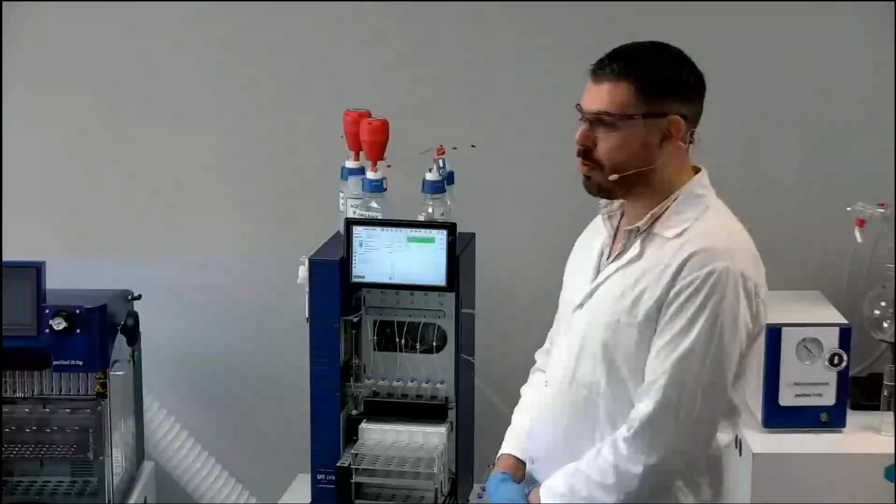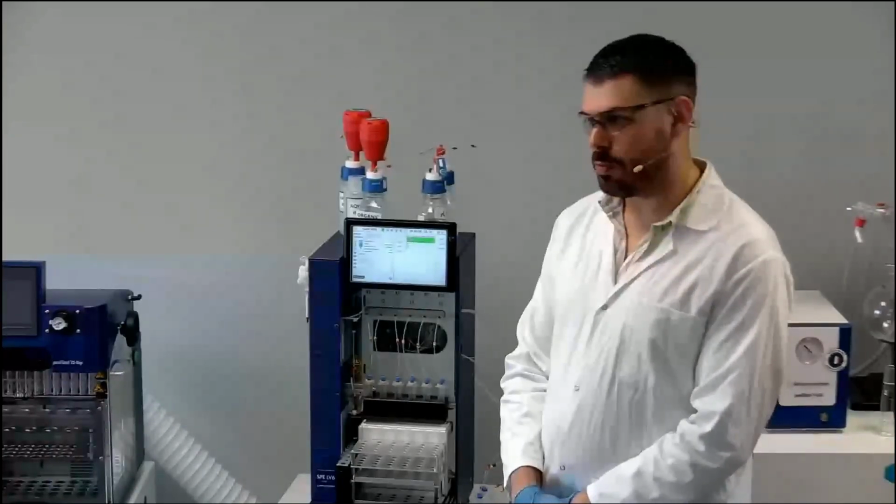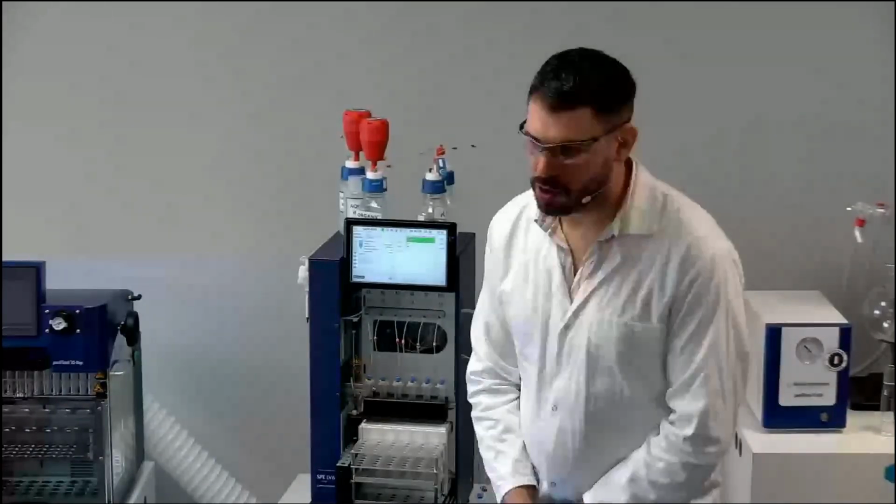Even if you have a pressure problem, the system will stop your purification method, especially to avoid creating problems inside the system. So you don't have a specific pressure to use with the system.